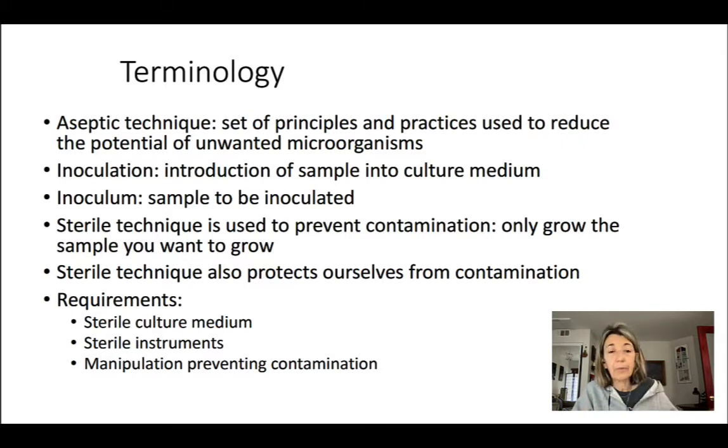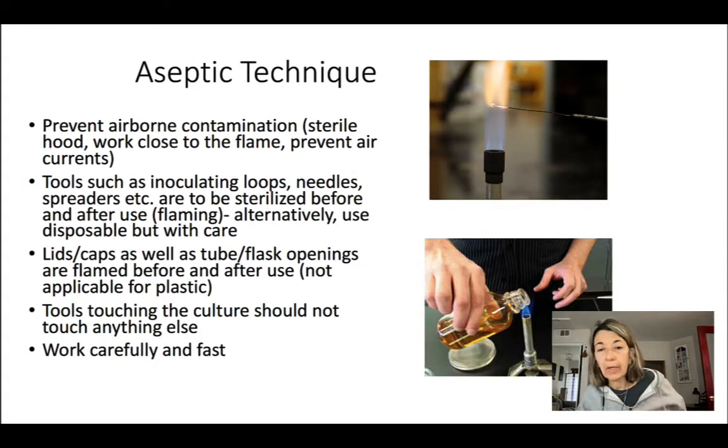And the sterile technique again has this double purpose of protecting your culture, so you're only going to get the growth that you want, plus protecting yourself. And the way you do it is, one, the materials you work with are going to be sterile, so instruments and culture media are going to be sterilized, and also the practices you follow are going to minimize the risk of contamination.